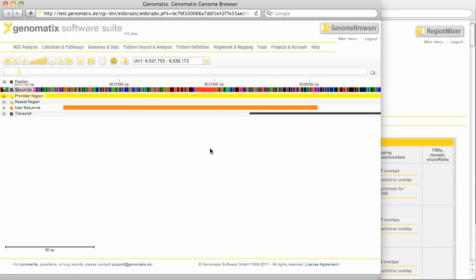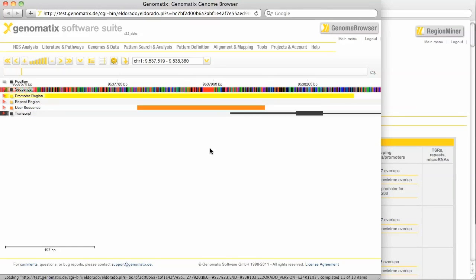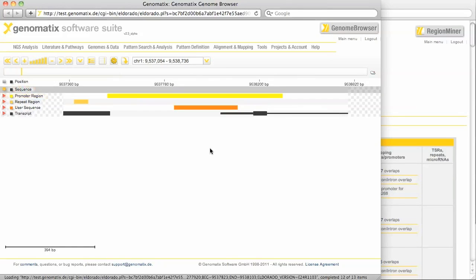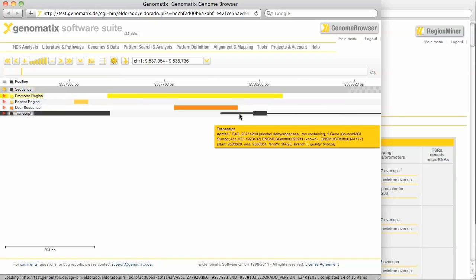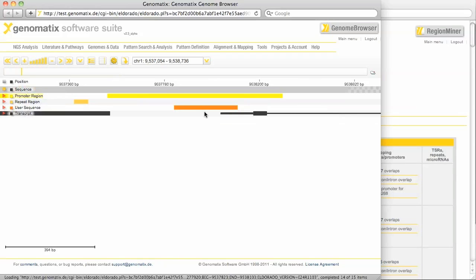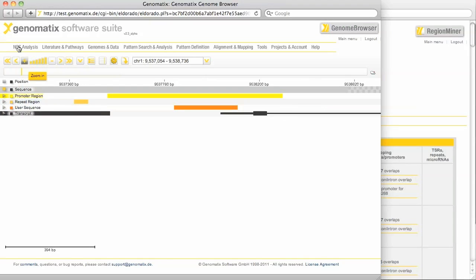We can zoom out a bit to see a larger region. The promoter belongs to the ADHFE1 locus as we can see here. For more details on the genome browser please watch the dedicated tutorial that you can find on our site.